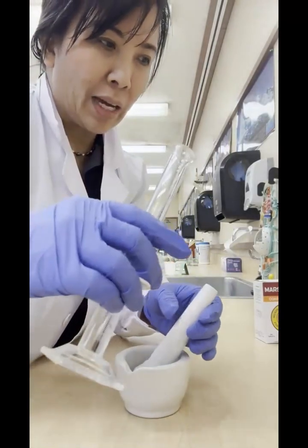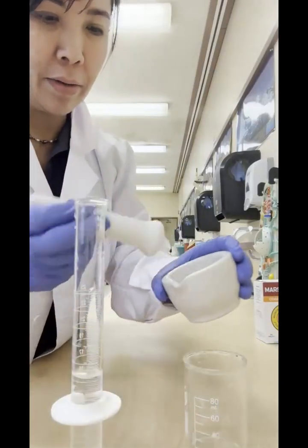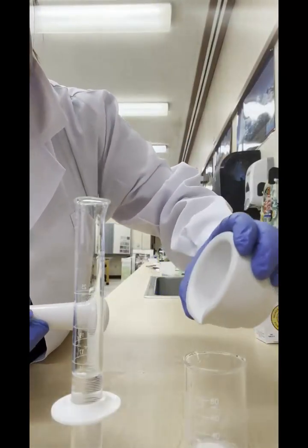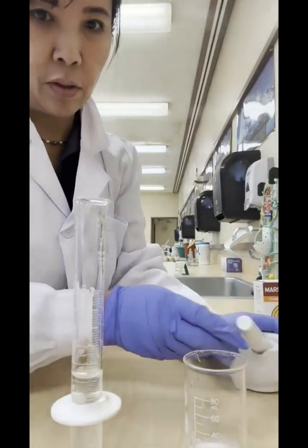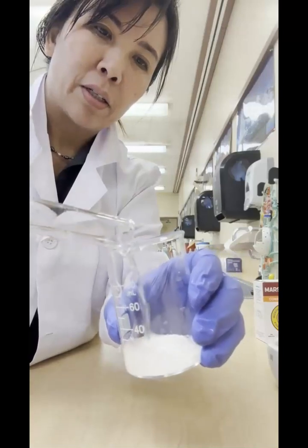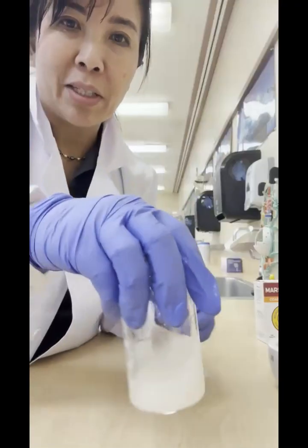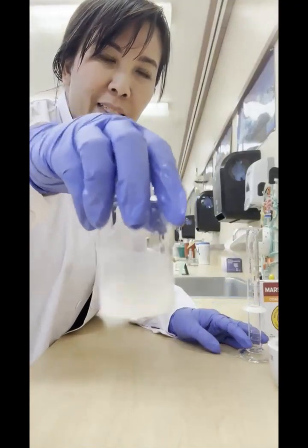And we're just going to add to the beaker our rennin powder, and we'll add our 15 milliliters of water. So this is our solution right now. This is what contains the enzyme. This is the rennin and the water, and this contains the enzyme.